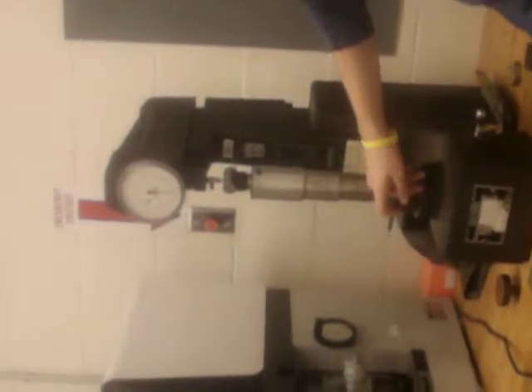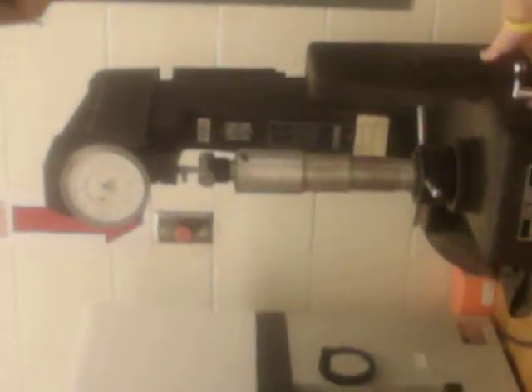So then you slowly move this until it touches, right here. And then, you are going to line this little needle up with that black dot. Move this — the dial — to zero. And then flip this little lever back, and let it go until it stops moving.